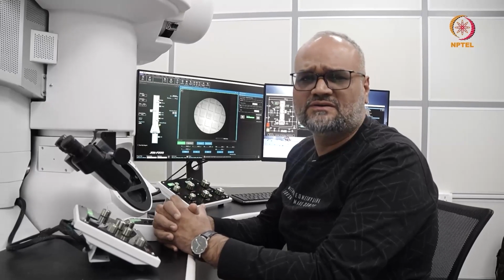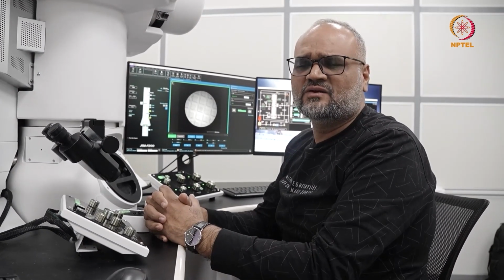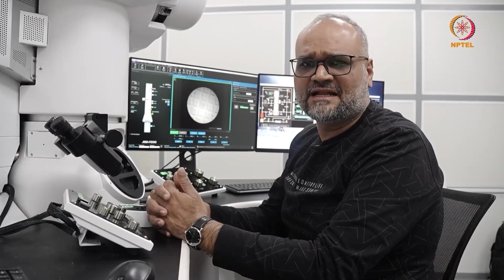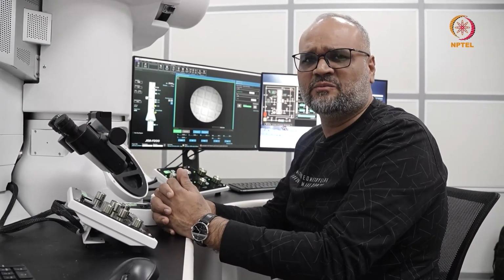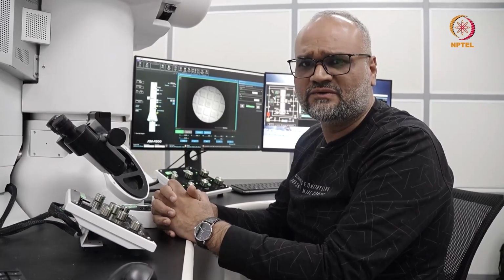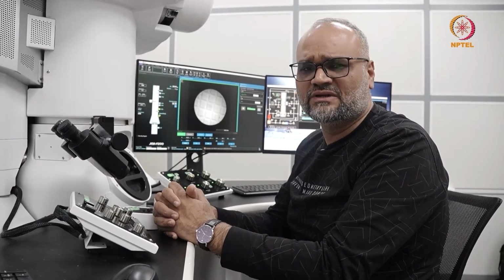Now I'll show you how to operate the microscope to get some lattice resolution images, or in other words, high resolution TEM imaging. What we do here is, after correcting the condenser stigmatism and condenser aperture, and bringing the sample to the right eucentric height, I need to search for an amorphous area on the sample. I bring the amorphous area and the feature of interest into the field of view. And more importantly, please remember that I have to first orient the sample along the right crystallographic orientation.